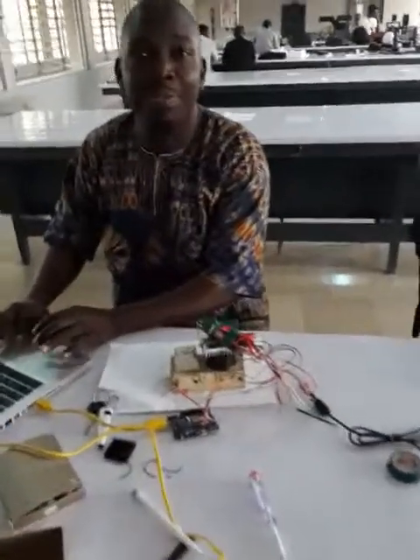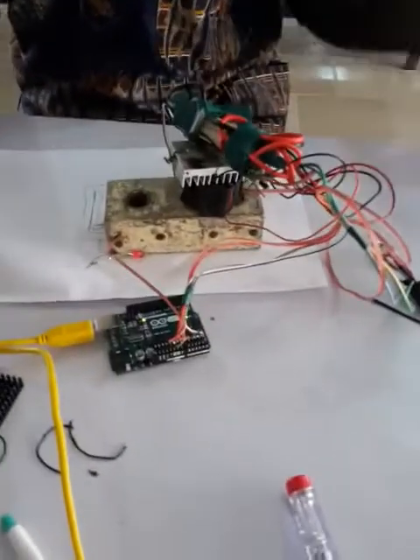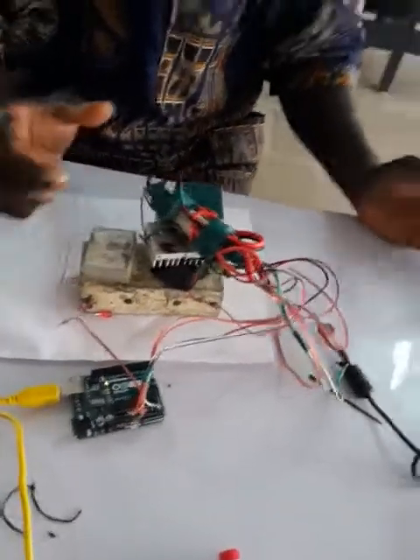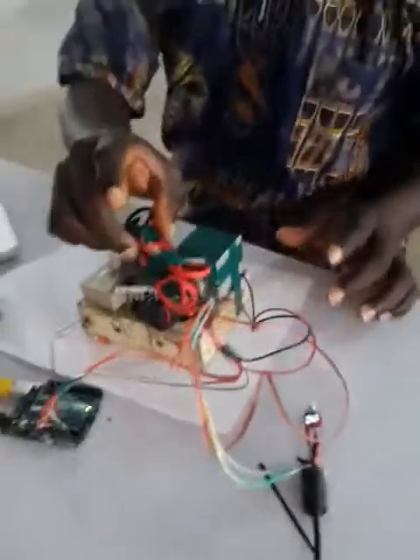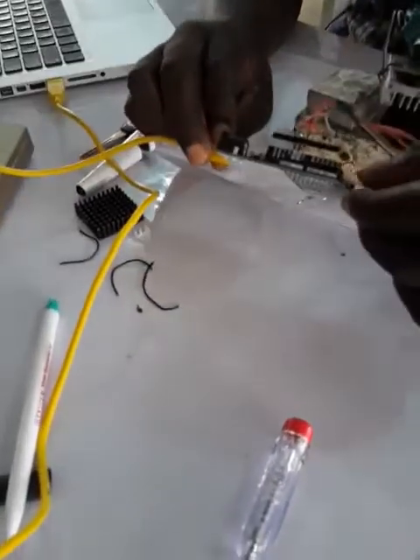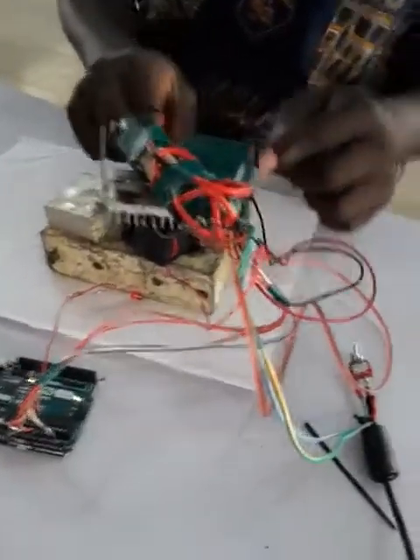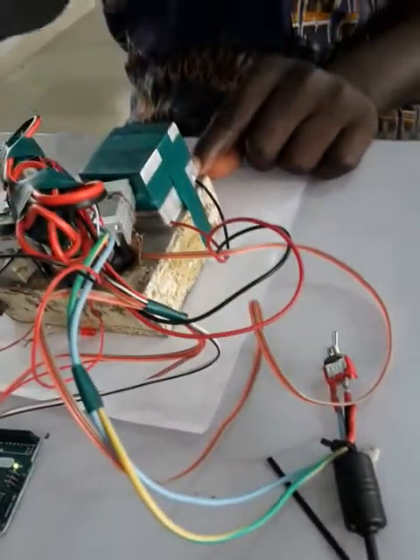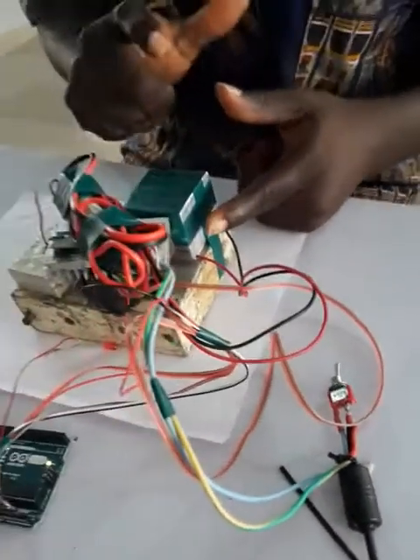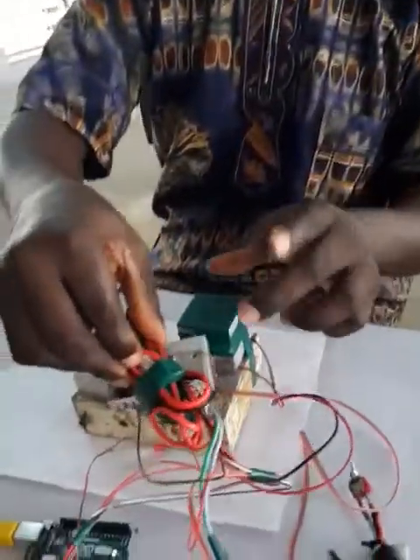So Aziz, tell me what this is — can you indicate what's what? Because you have a prototype but it's a big mess of wires right now. This is our Arduino, which is the brain that tells the material what to do. We've got a Peltier element that is used to provide the heating, and this is our aluminium heating block. We're going to drill holes here for the PCR tubes, and then we have our H-bridge.